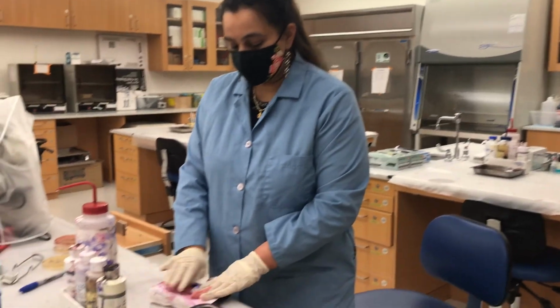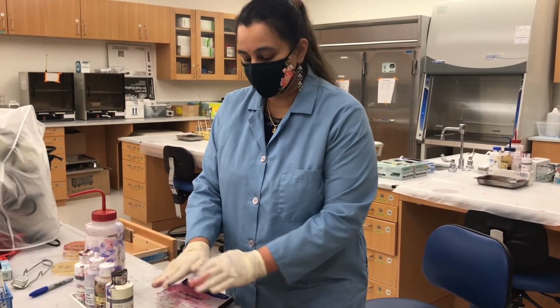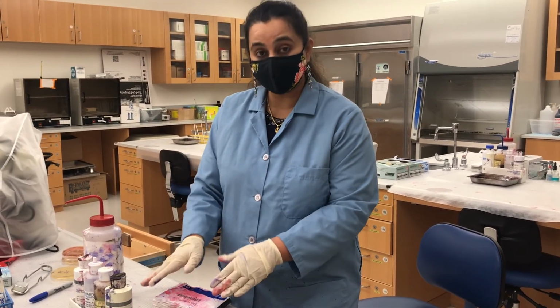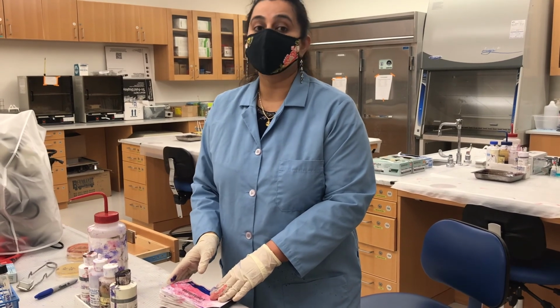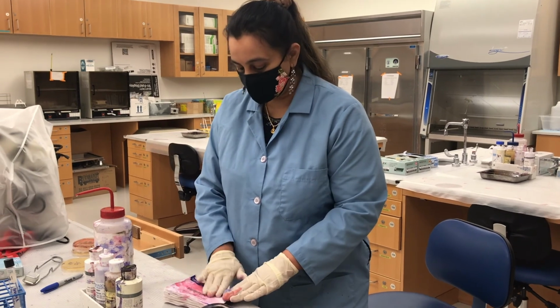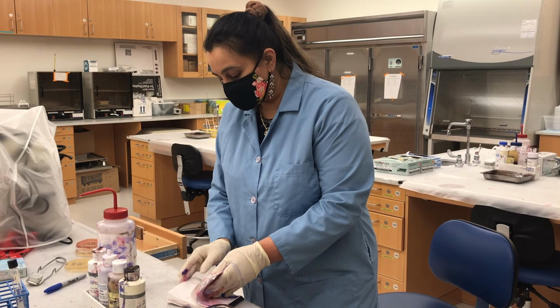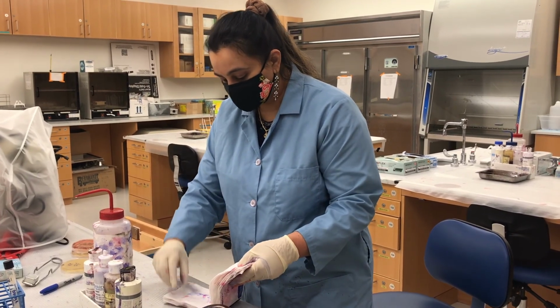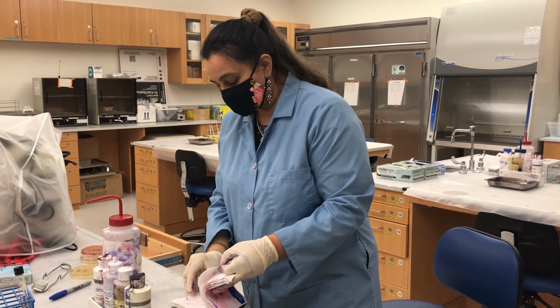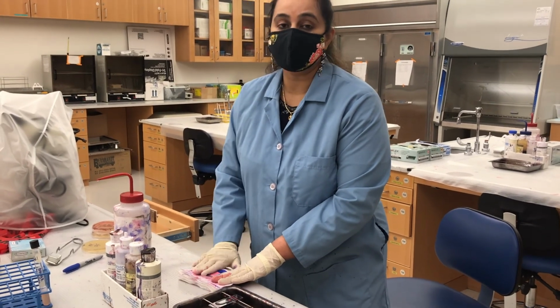I've noticed over the years that students do all this procedure, and when they are at this step, they press too hard and the slide breaks into two. Please be careful, be gentle. You don't want that to happen at the very end of your gram staining procedure. So just gently press it and make sure you remember the side that you have your cells on. You don't want to flip the slide. And I still see some water, so I'm going to press it for a little longer. The goal is to have a slide that's completely dry.